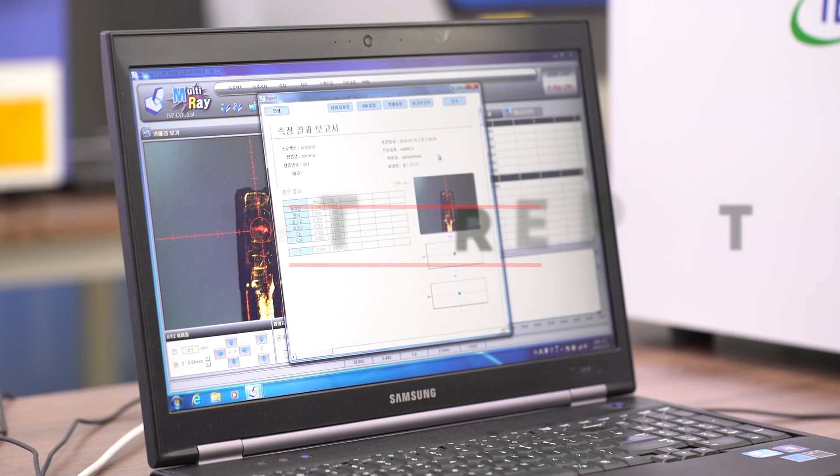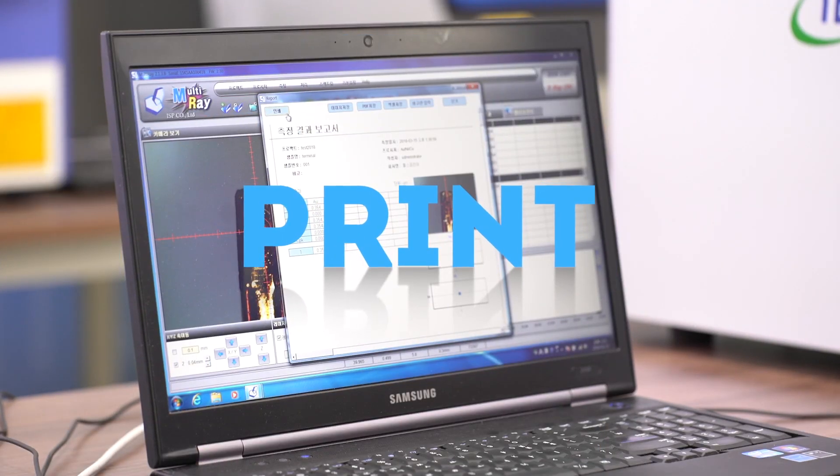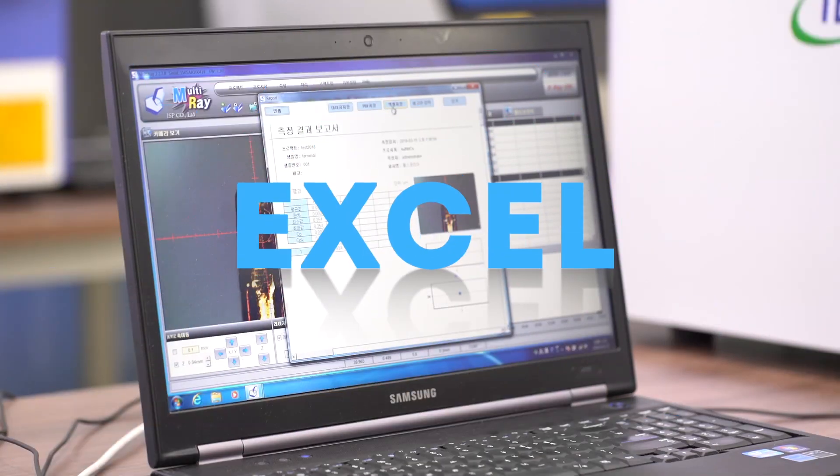Result reports can be output to printer, PDF, or Excel.